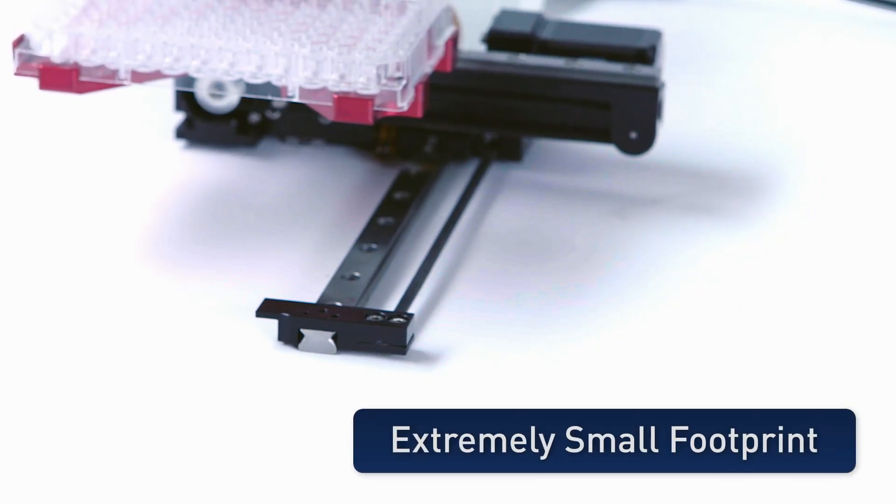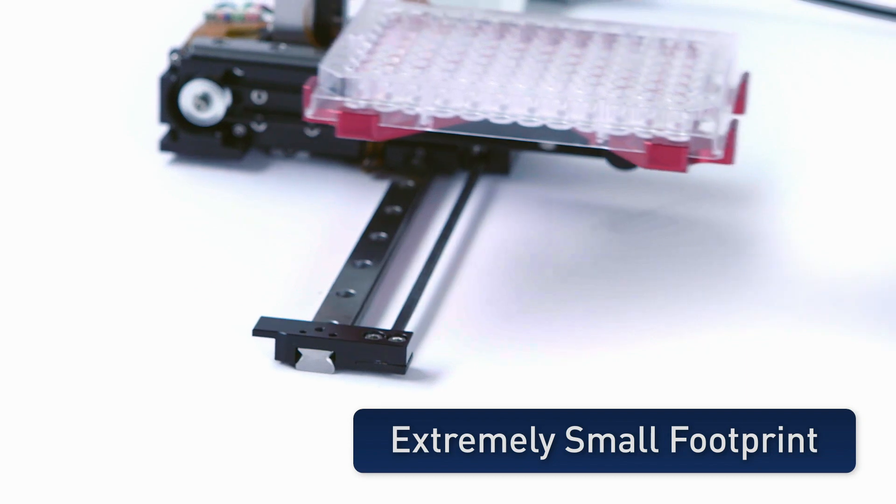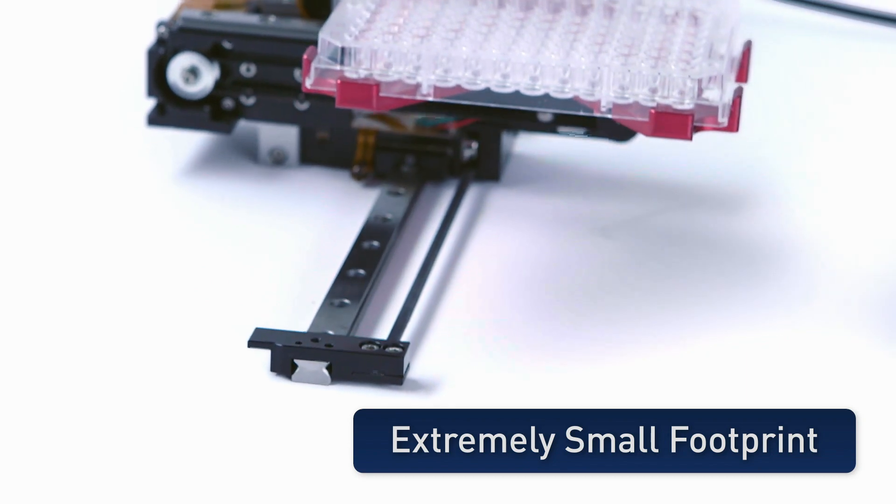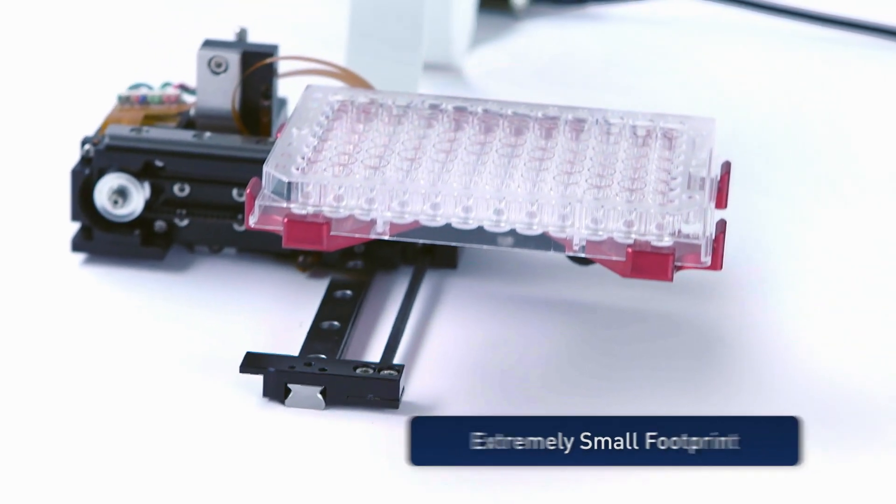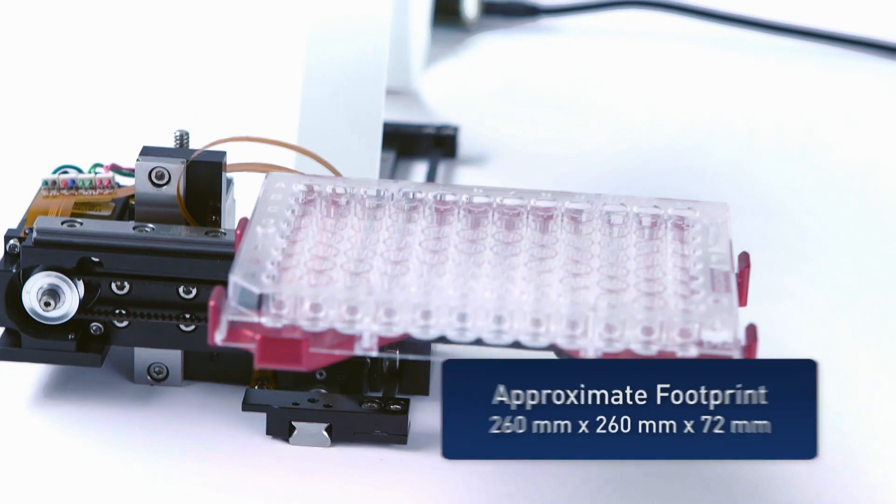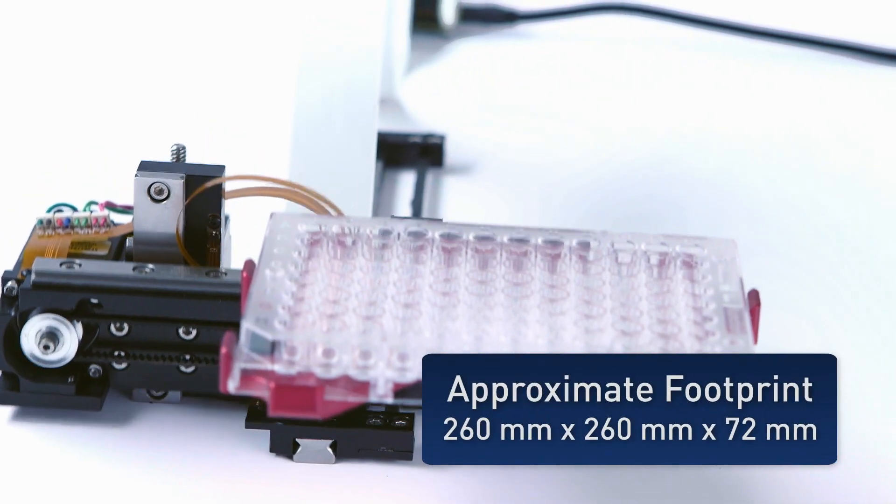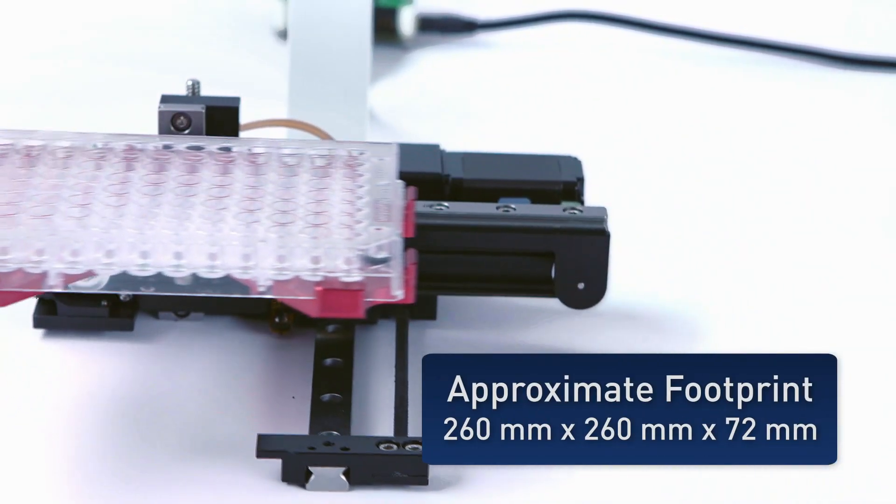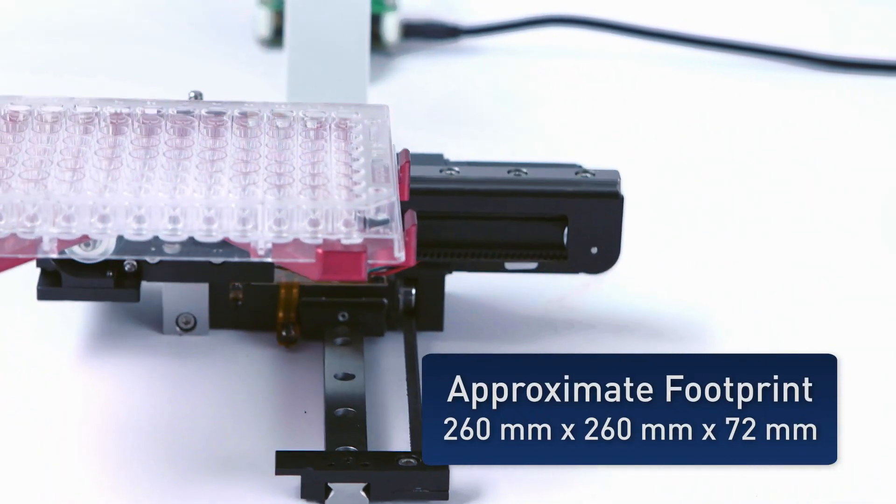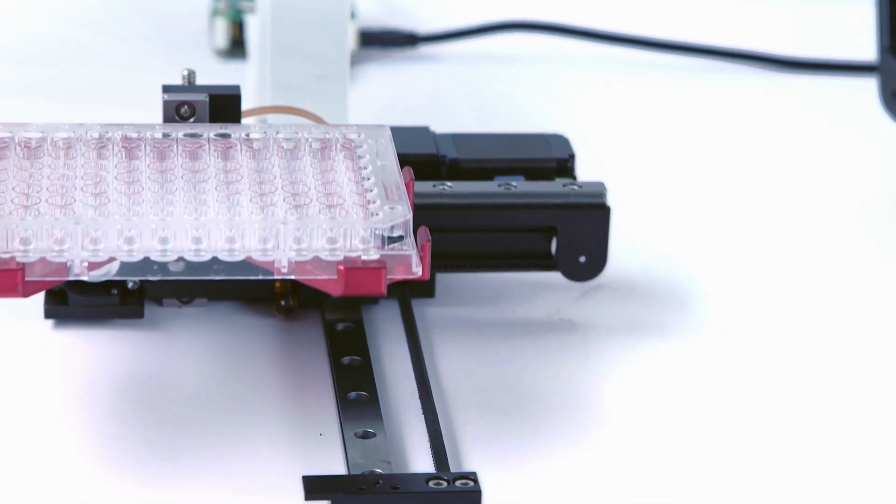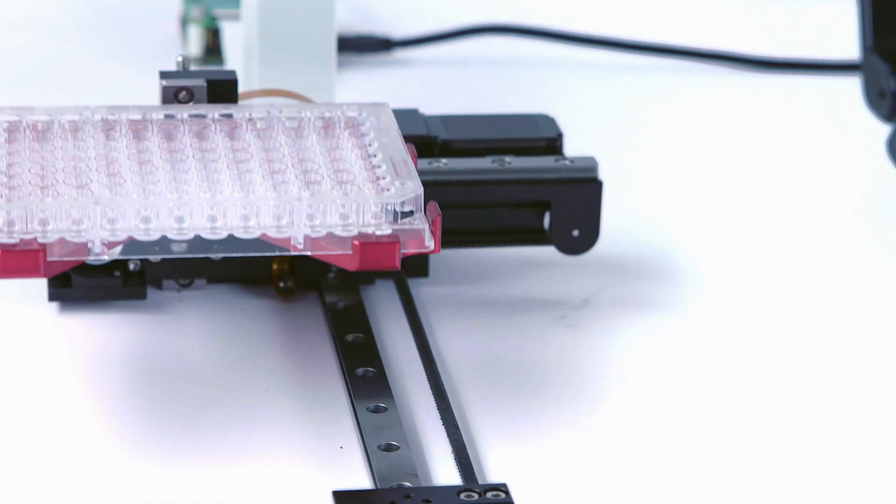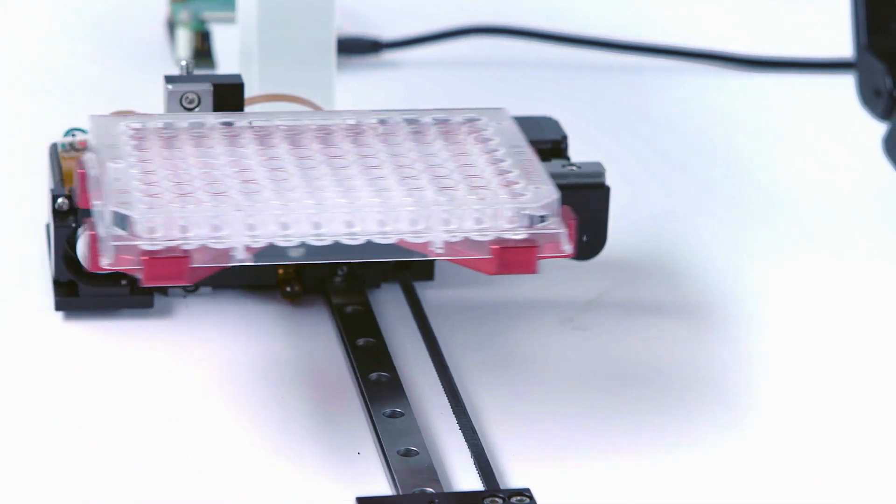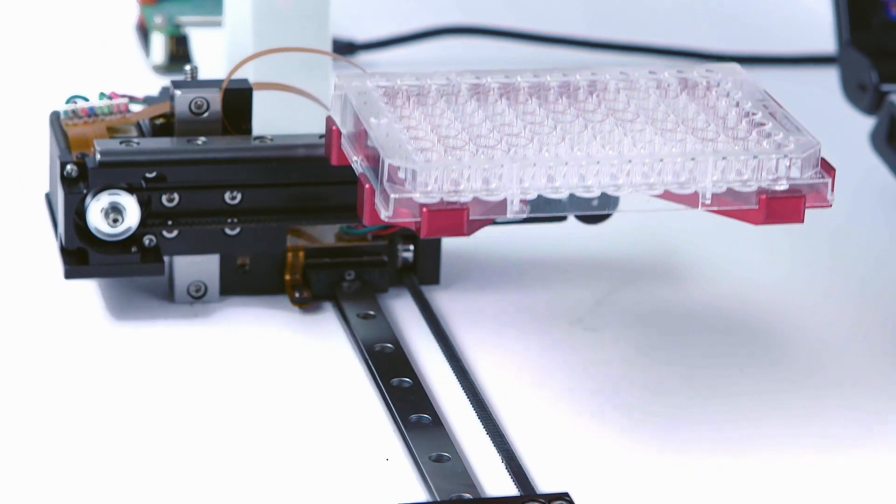The system is packaged to be very compact. The robot's footprint is more narrow than the area required by a microplate to access all its wells, meaning the robot will not increase your instrument width beyond what is required by the process. In the lowest position, the microplate is about 60 millimeters above deck, minimizing instrument height.